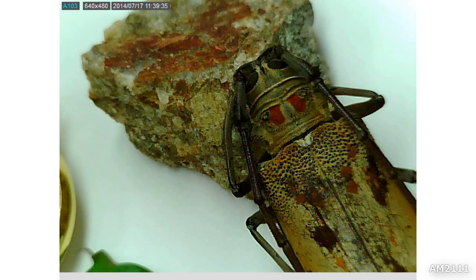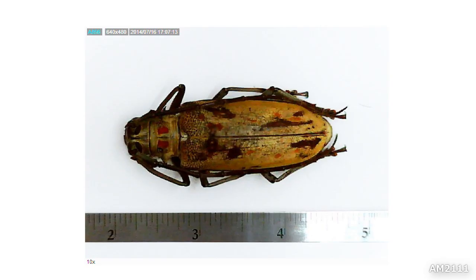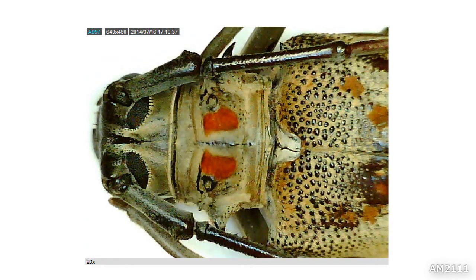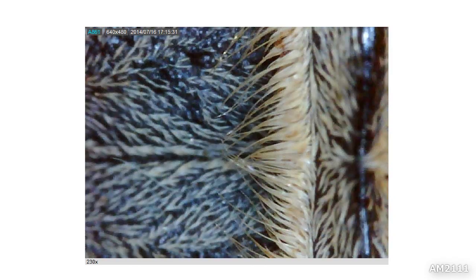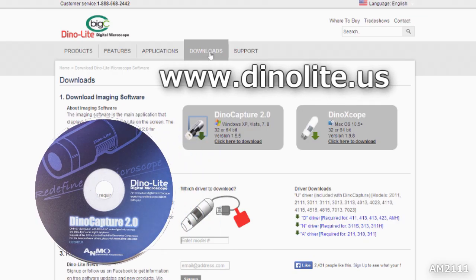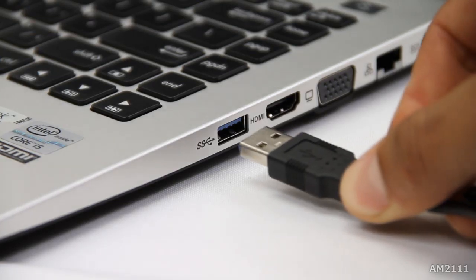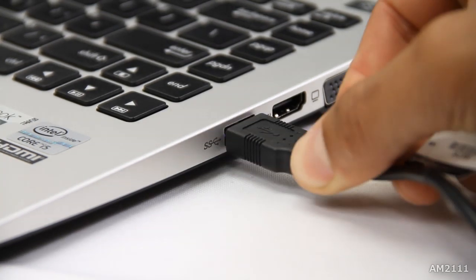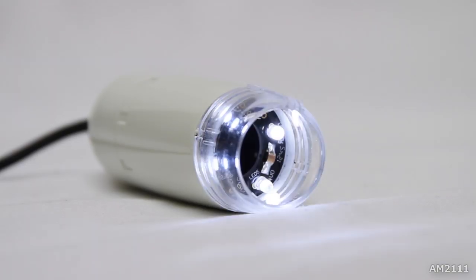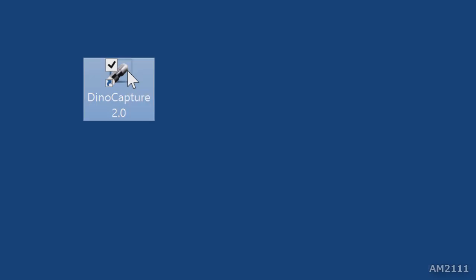You can download the latest version of DynoCapture 2.0 for Windows or DynoXcode for Mac at DynoLite.us or use the included CD. Simply install the software, connect to USB and open the software to use.